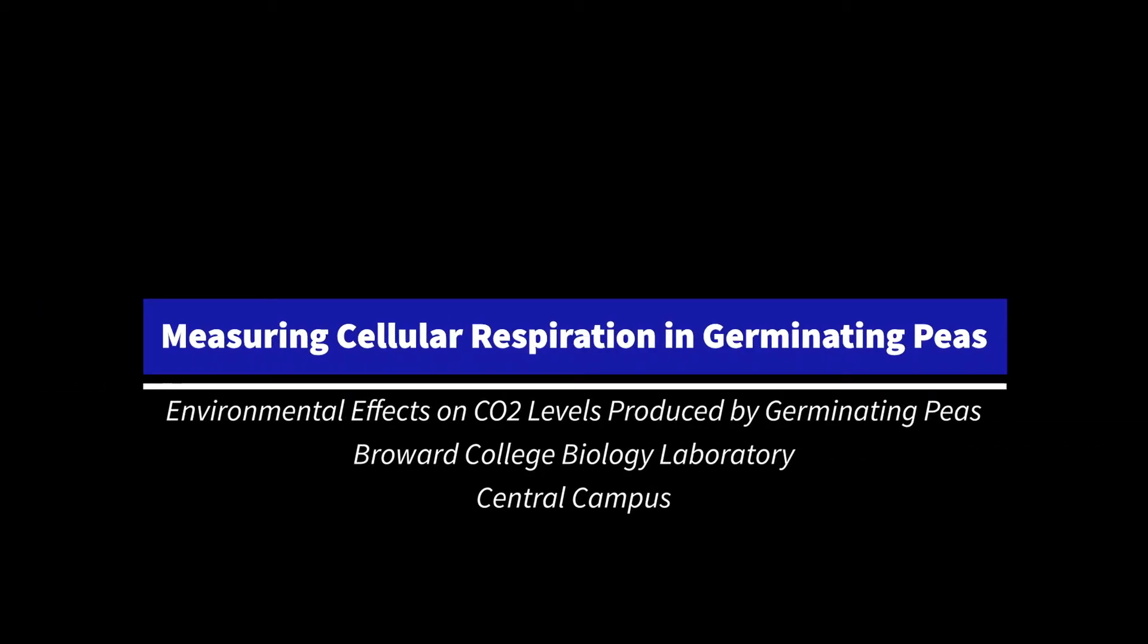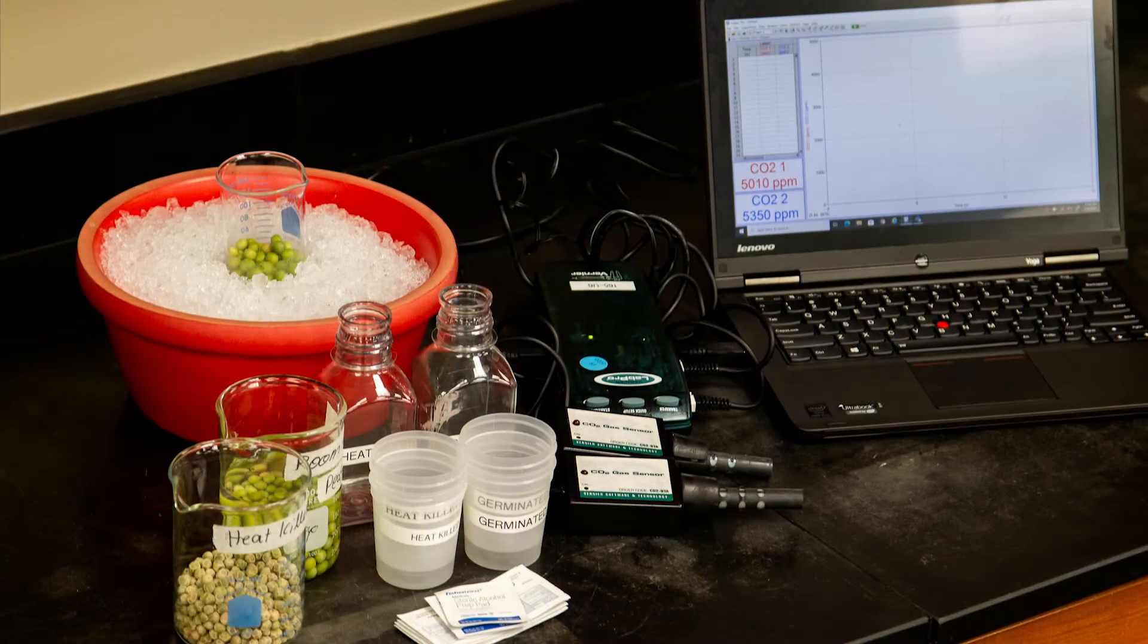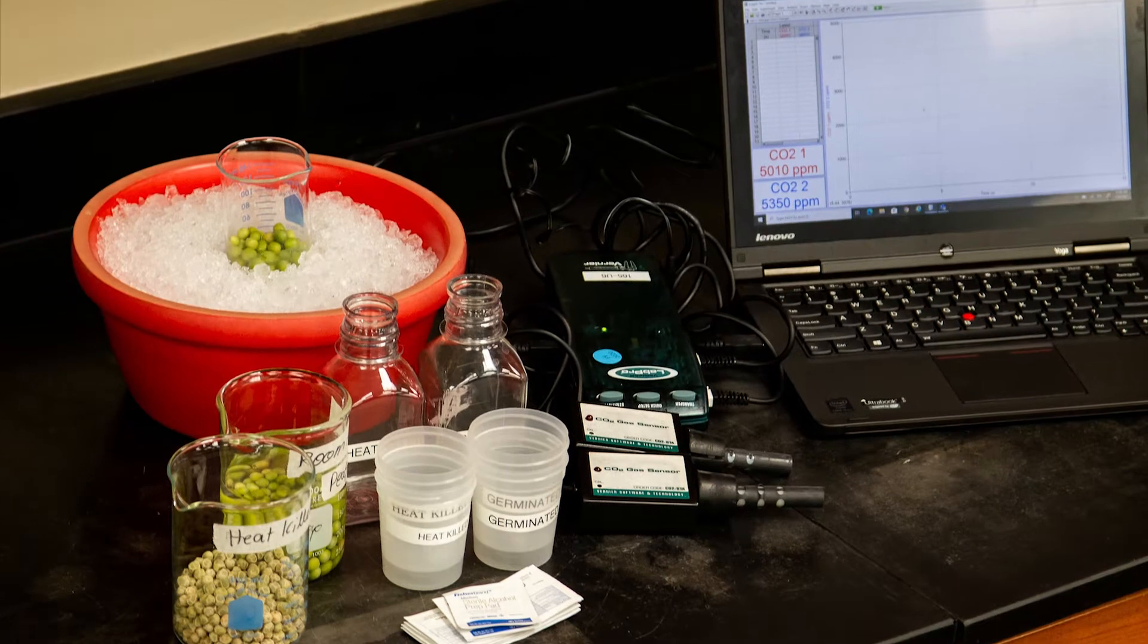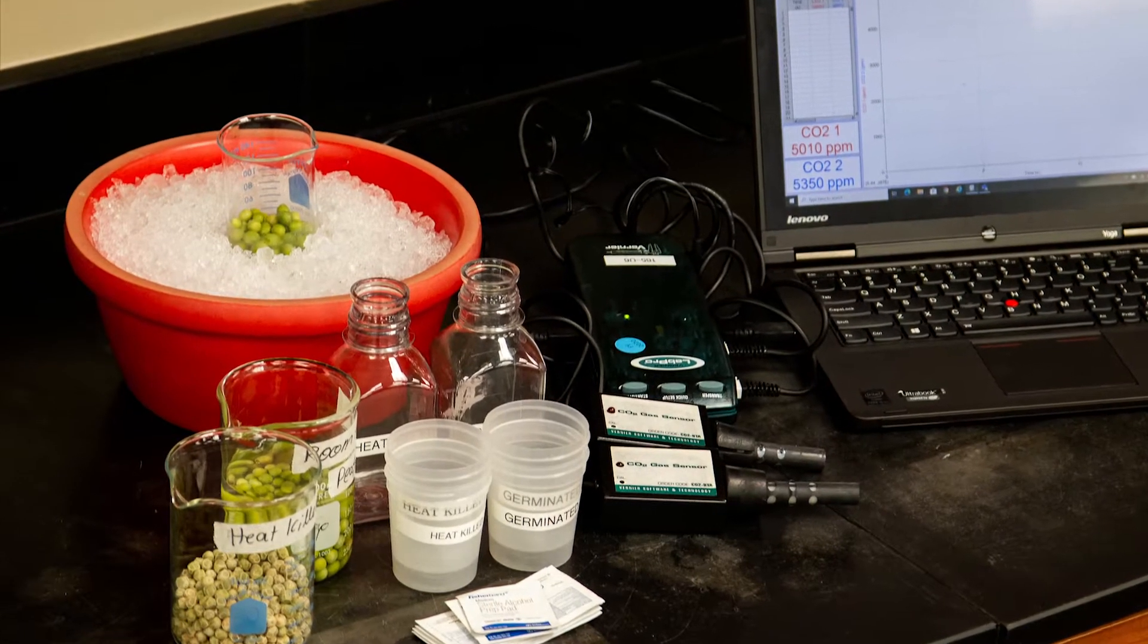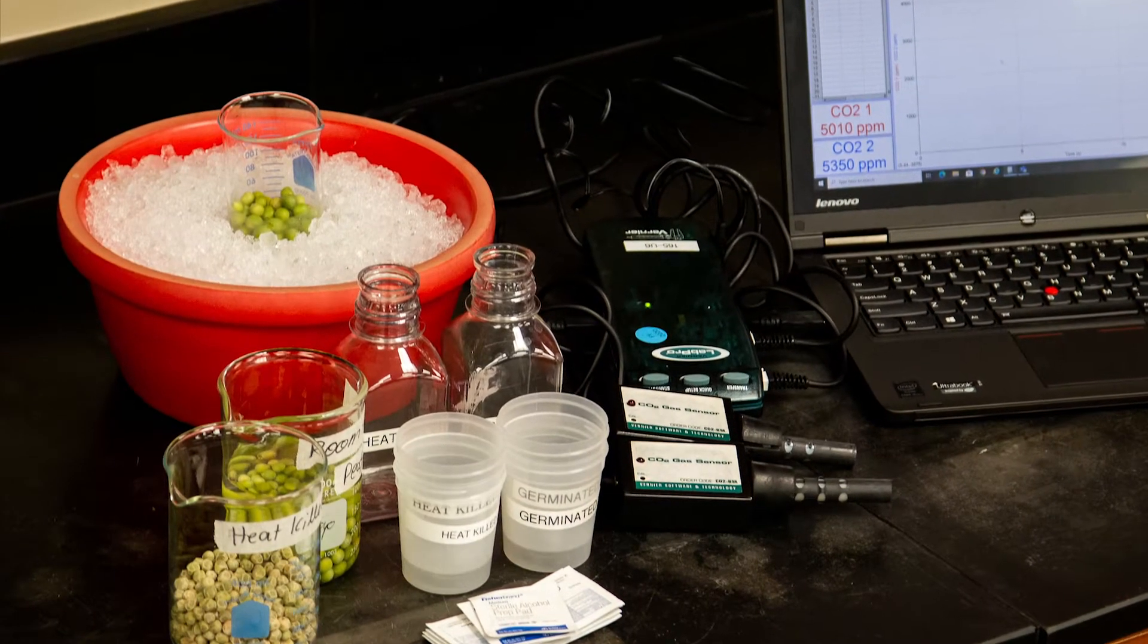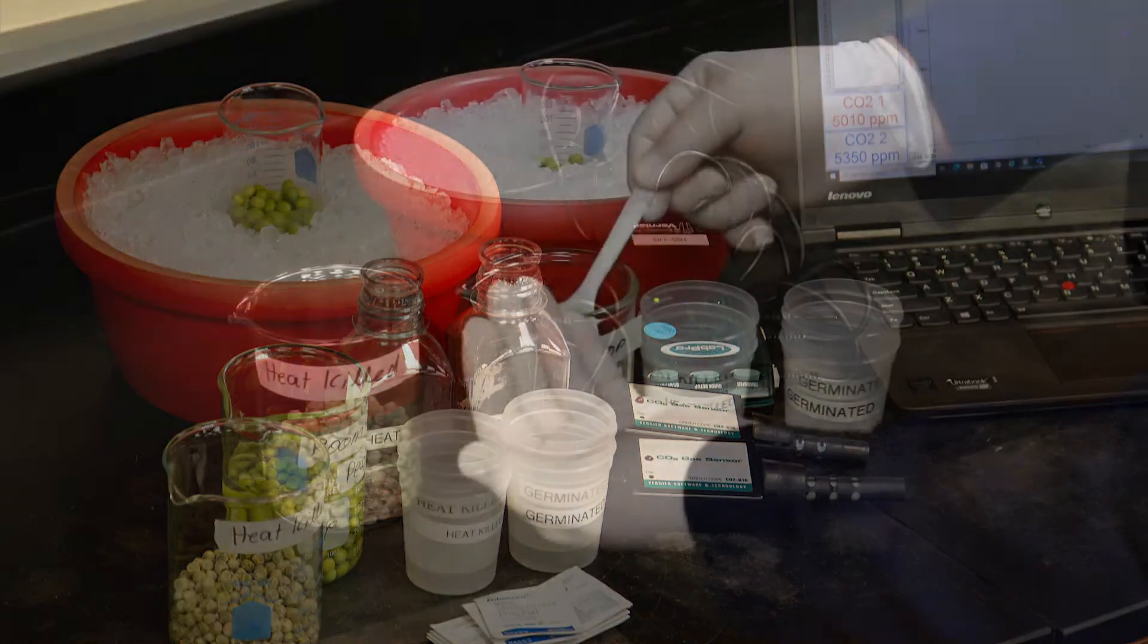Hello, for today's lab we will be measuring cellular respiration in germinating peas. We're going to be looking at some environmental effects on the levels of CO2 production using germinated room temperature peas, heat killed peas, and germinated peas on ice.